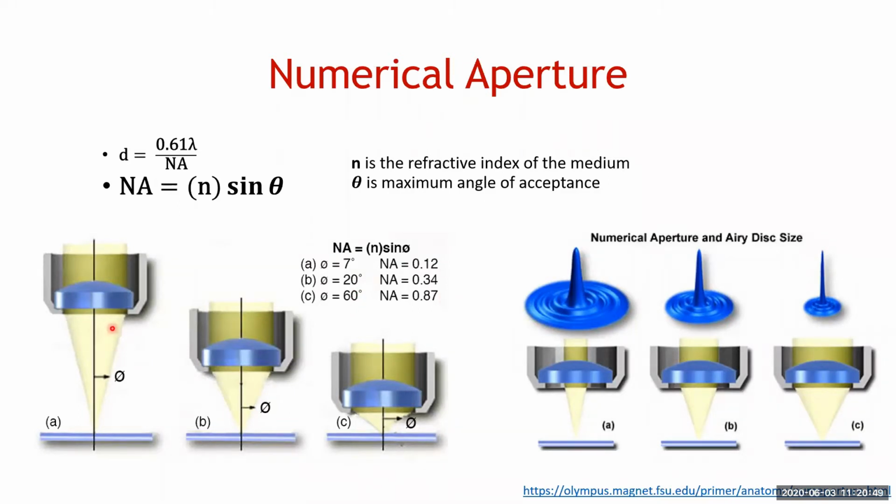The other thing that you notice is that this cone of light gets steeper and steeper, or at least gets smaller and smaller, until it gets really, really close to the sample. For those of you who've used air lenses and objective lenses, you can be quite familiar with this, where you start out pretty far away, then you end up being jammed 140 nanometers away, well, sorry, microns away from your sample.